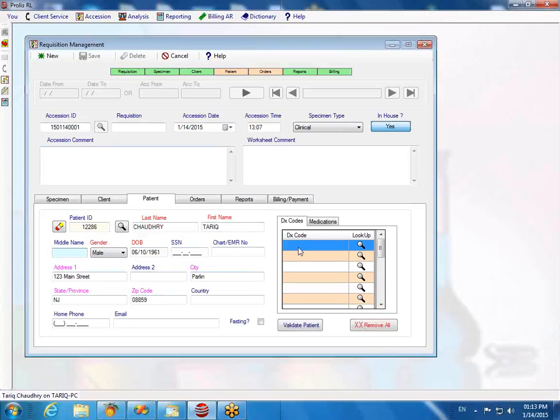Since you do the study for the sleep centers, sometimes they report the medications to you. And those medications should be entered here, line by line. So we get medications as well. Yes, you do. I'm going to show you without the medication and with the medication what difference it makes, okay? First, I'm not going to enter any medication right now.